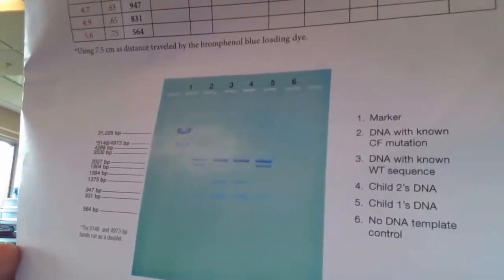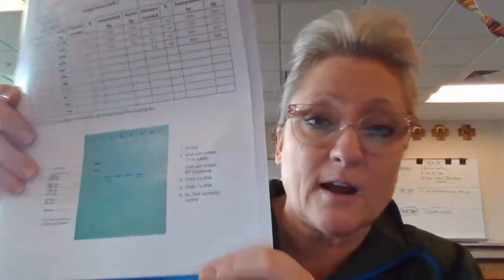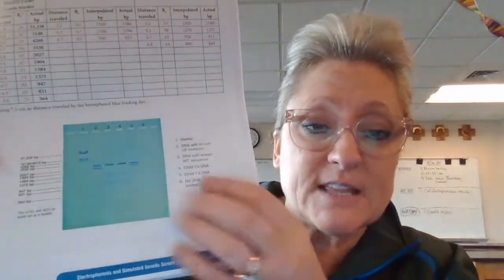Boom. All right, so then what we did is we measured the distance that each band traveled from the starting point, from the well. We used centimeters, we used a ruler, and we just took this picture. The gels pretty much turned out, but there was something goofy going on with them. I think there was a contaminant in the beaker that I used, because there was some stuff floating in there too. So we were able to see them, but not well enough to really distinctly be able to measure them. So I did a picture, and we just used this, and they measured.